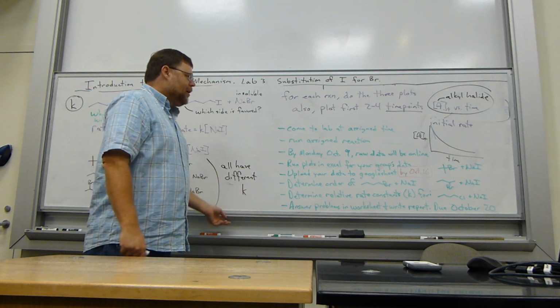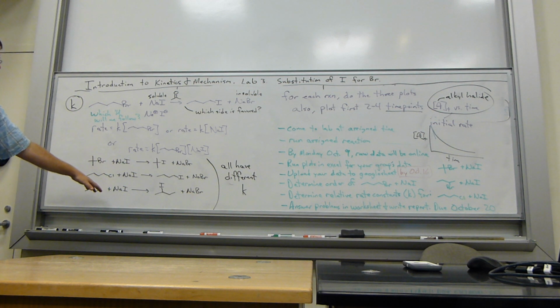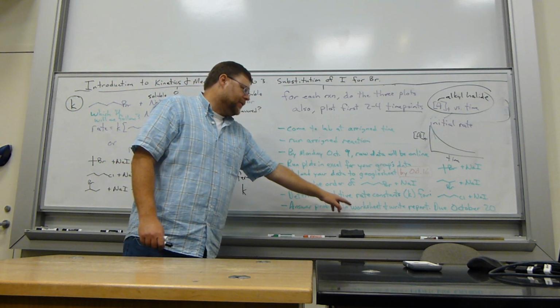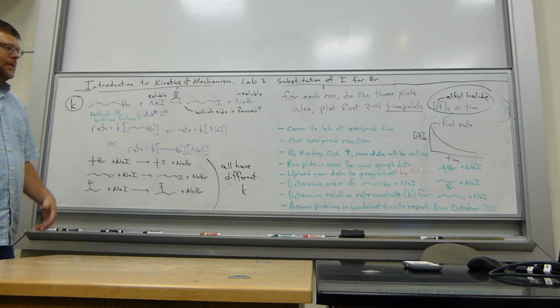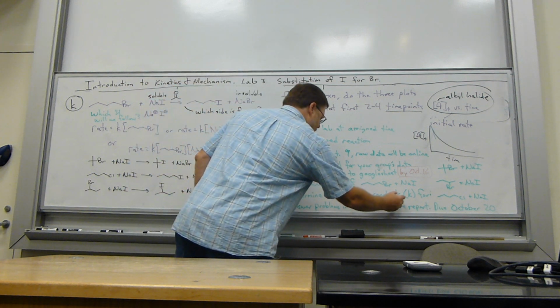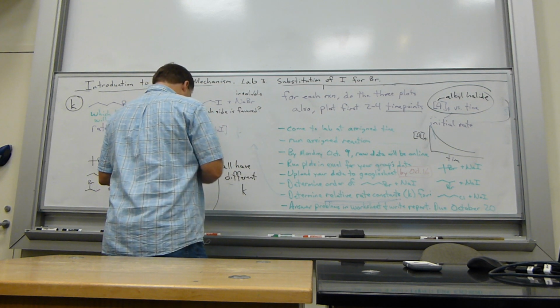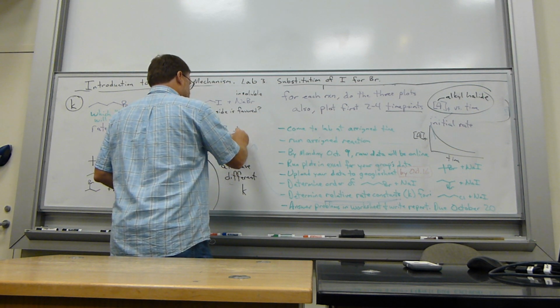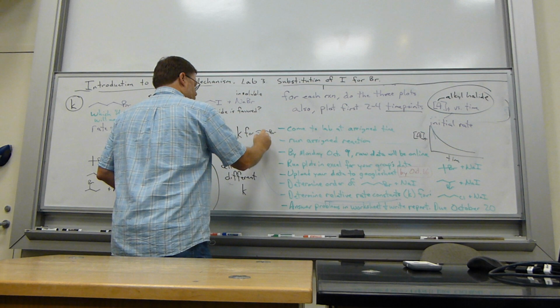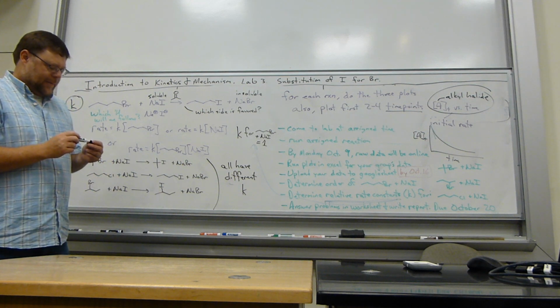And so then, by comparing that initial rate for n-butyl bromide and sodium iodide and these 3 reactions down here, you're going to be able to get relative rate constants for n-butyl chloride, sec-butyl bromide, and t-butyl bromide. Right? And so for this relative rate constant, set n-butyl bromide with sodium iodide equal to 1.